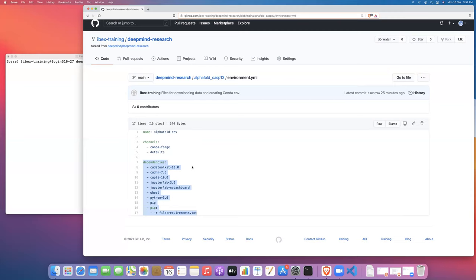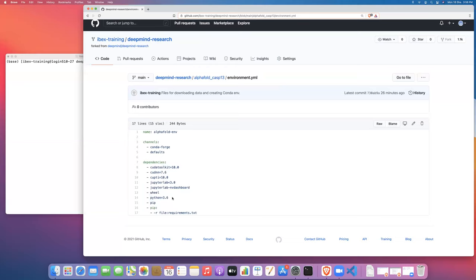We need to use version 10.0 for the CUDA toolkit, 7.6 for cuDNN. The version for CUPTI needs to match the version for CUDA toolkit. These are the versions that are compatible with TensorFlow 1.14, which is the version of TensorFlow that was used by AlphaFold. Then we're going to install JupyterLab and jupyterlab-nvdashboard, and then wheel and Python and pip. We're going to use Python 3.6. Python 3.6 is the version of Python that is compatible with TensorFlow 1.14, which was used by AlphaFold.